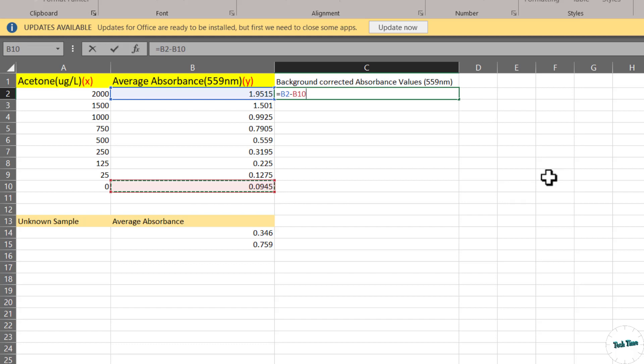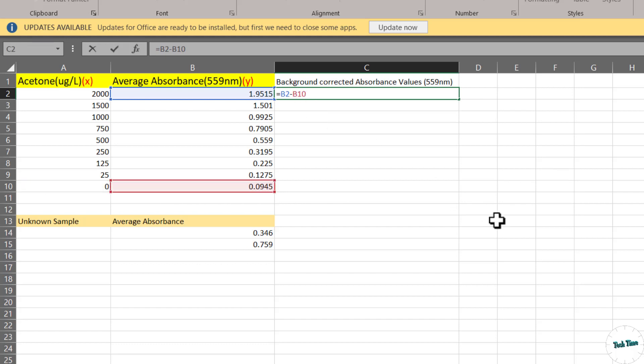One more thing we need to do right over here is to insert a dollar sign before and after this cell B. I'm going to insert it by pressing shift and the dollar symbol on my keyboard. Let me insert it after the B cell as well. And there we are. Now press enter.